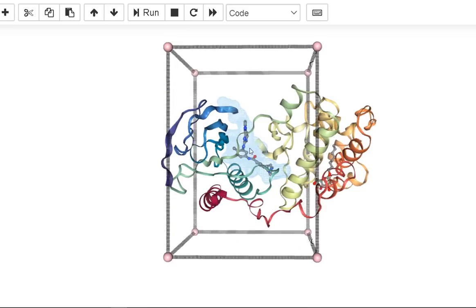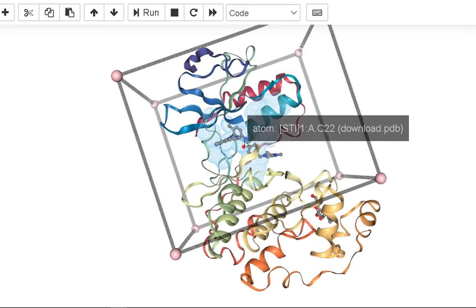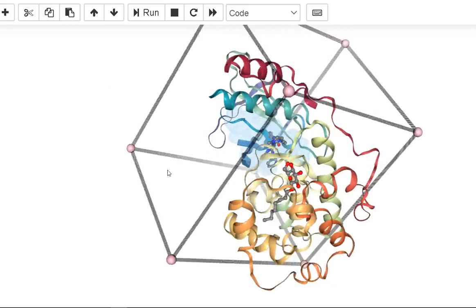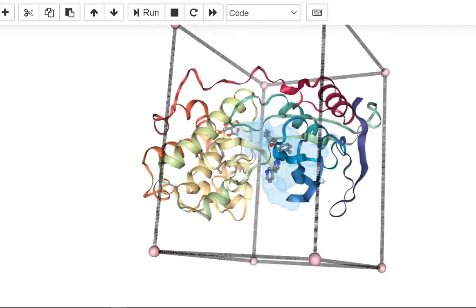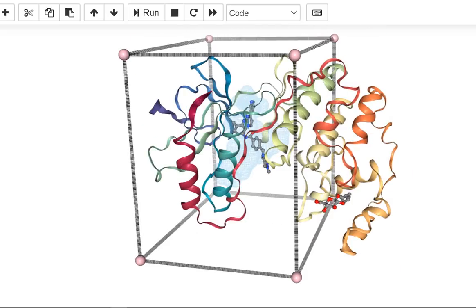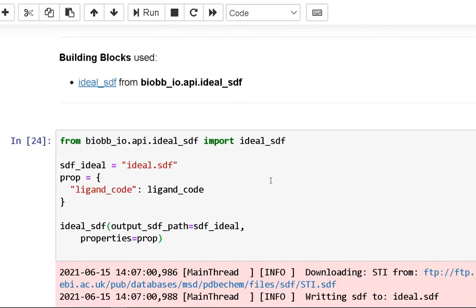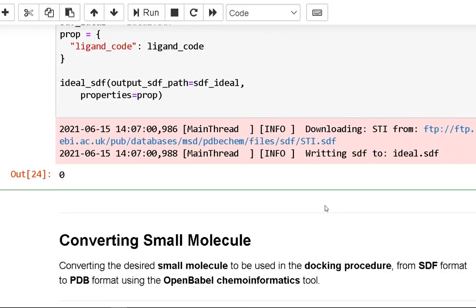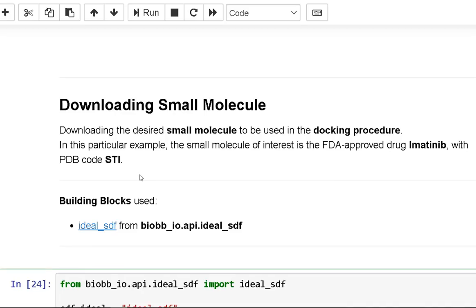We then check that the specified cavity is positioned in the same region as the original ligand, using the original structure with the small ligand inside. For downloading the small molecule, the chosen small molecule is downloaded. The FDA-approved imatinib with PDB code STI is the small molecule of interest in this case.